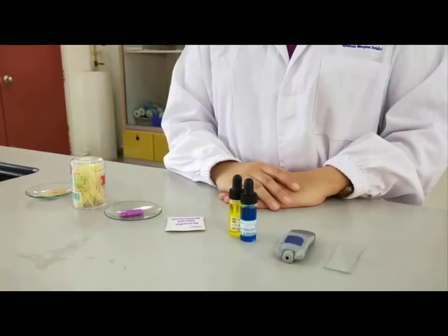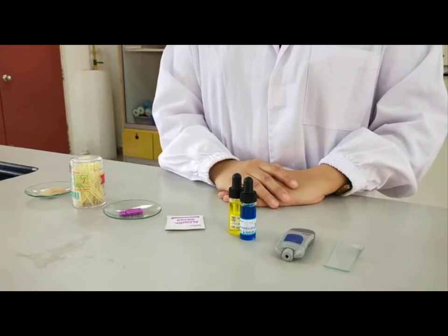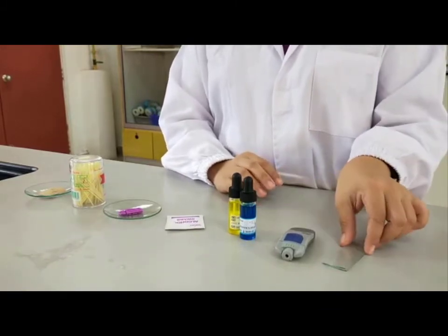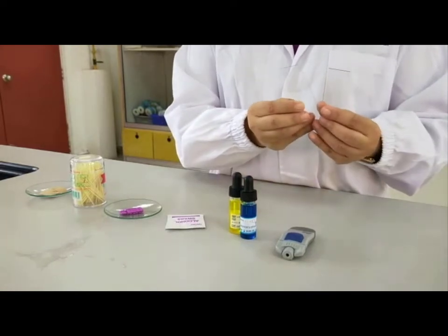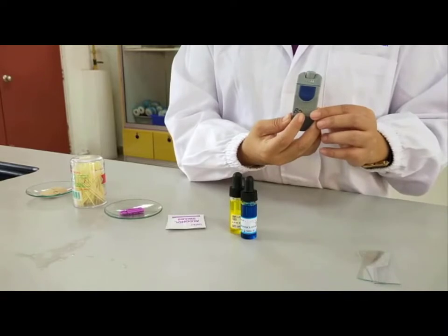So in this video, we are going to introduce the materials and apparatus that will be needed during the experiment. First we need 2 clean slides and a lancing device.